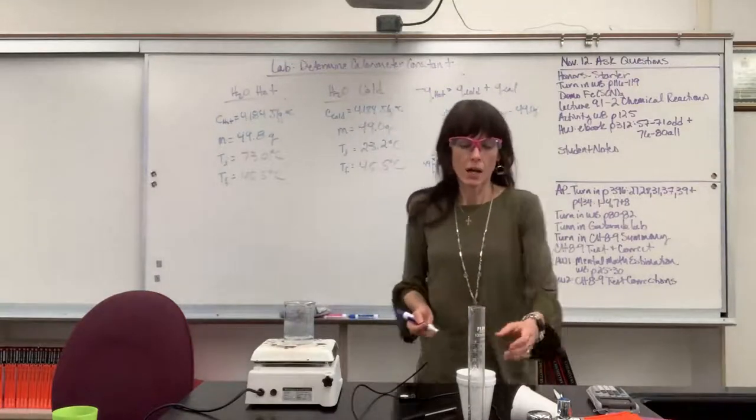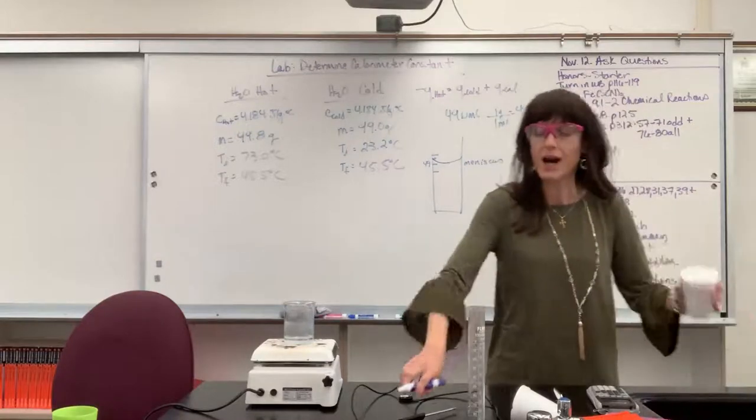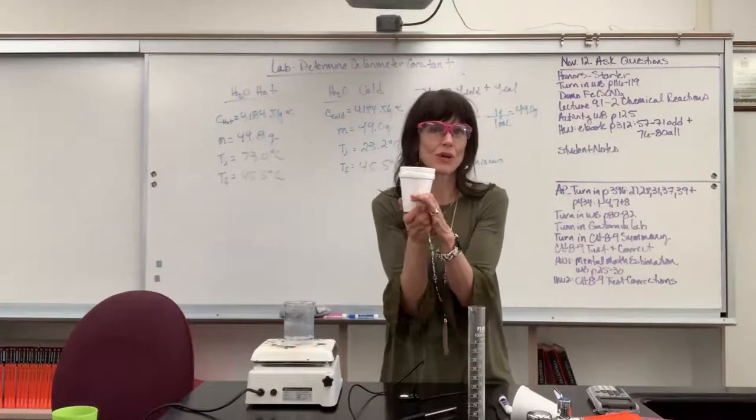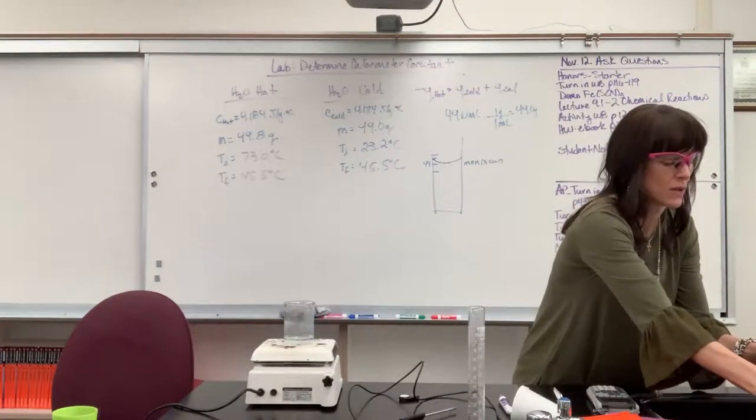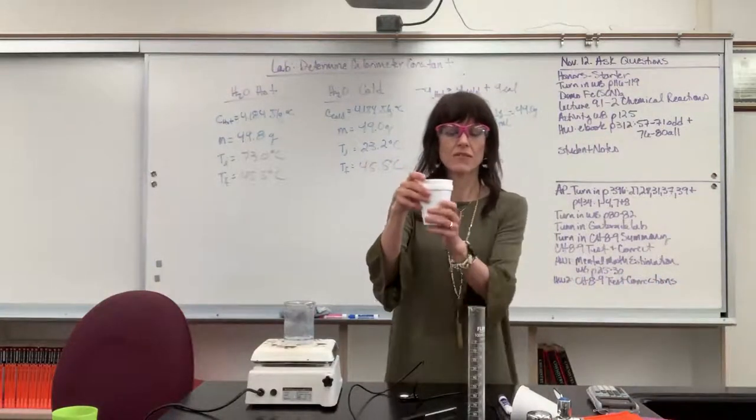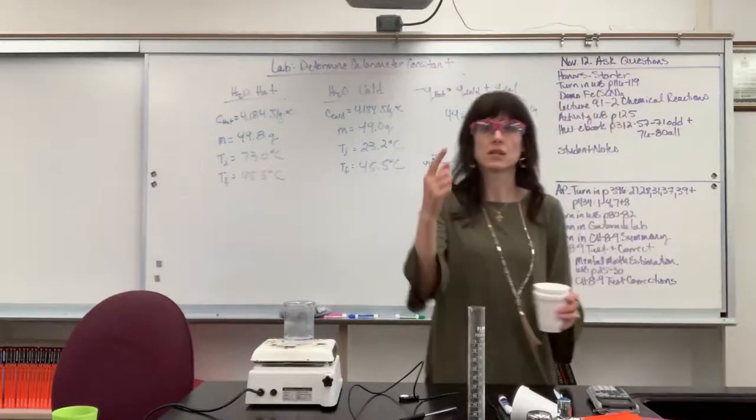So, at this point, I can pour this water out. I would, to do my second trial, I can feel it just warm. Okay, it feels a little warm because it got up to 45 degrees. I would take my tap water, and I would swish it around because I'm trying to absorb that energy out of that warm cup. Pour that out, and then I would start over.